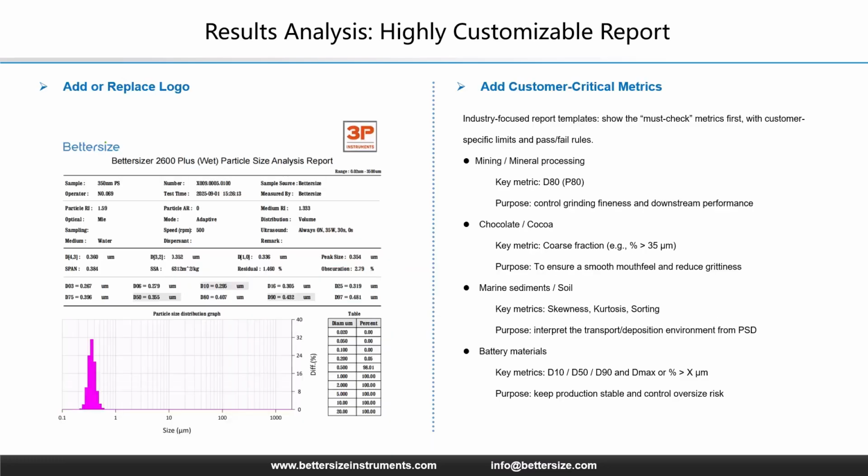A report should not just be data. It should be a direct answer to your industry's specific question. We allow you to strip away the noise and highlight the customer-critical metrics that drive your processes. Consider the diversity of applications.